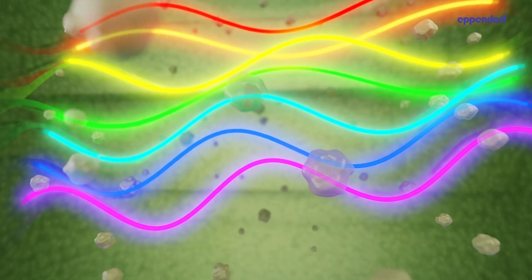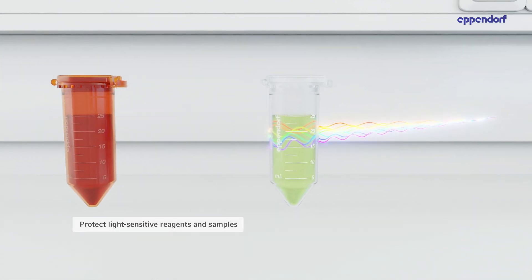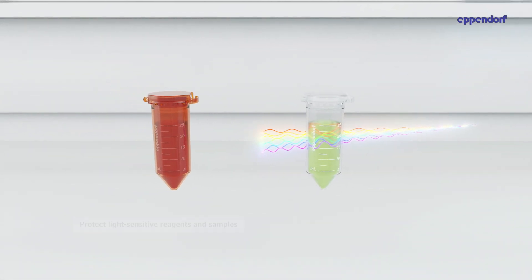To avoid those difficulties, light-sensitive reagents and samples must be handled and stored in a manner that protects them from direct exposure to light.